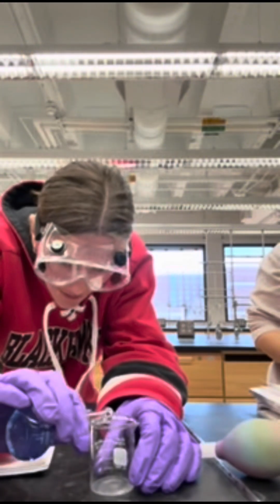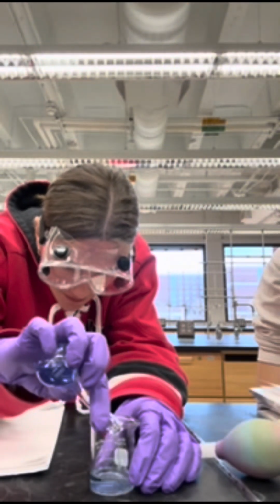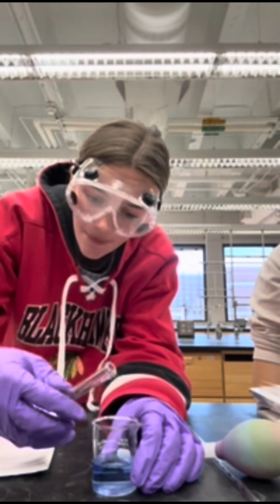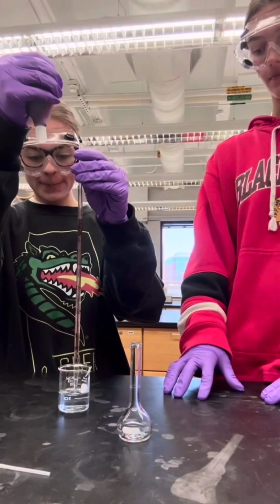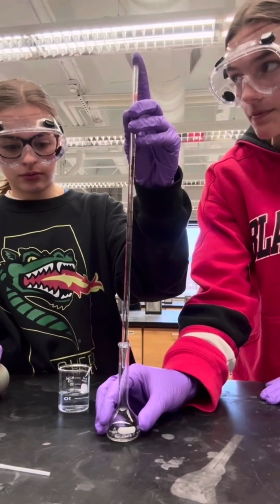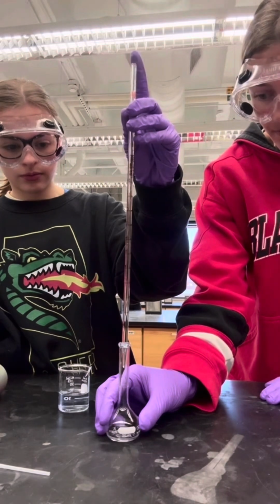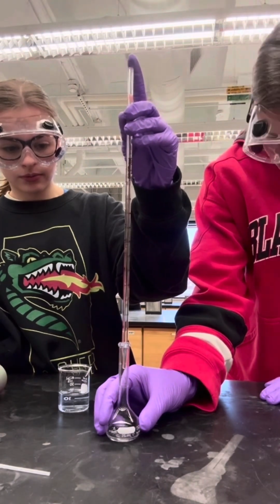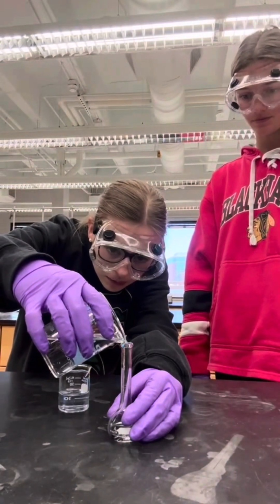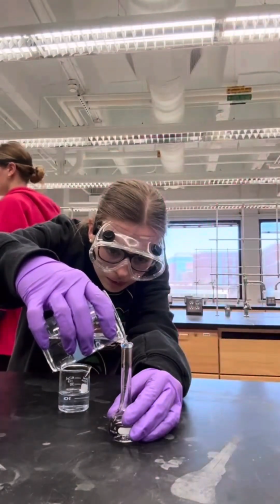Transfer the solution to a separate clean, dry beaker so that the volumetric flask can be used to prepare another solution. To prepare the second solution, transfer a small portion of the first diluted solution to the 25 ml flask and dilute as appropriate. Repeat this process for the third dilution using a small portion from the second diluted solution.